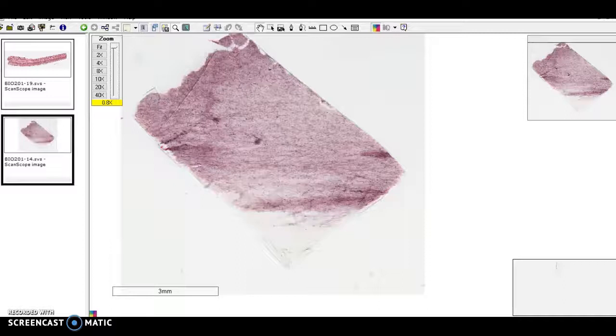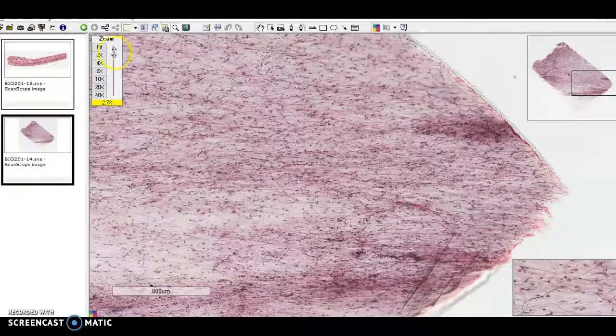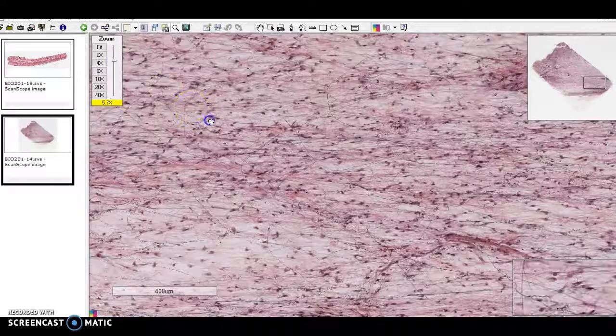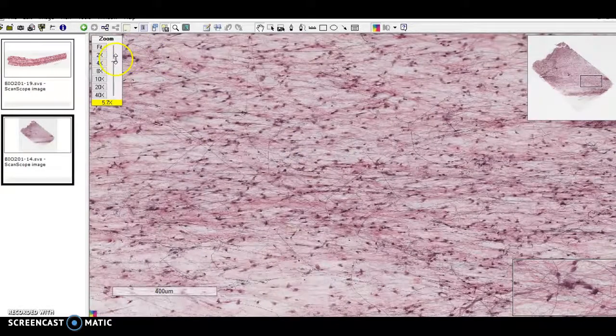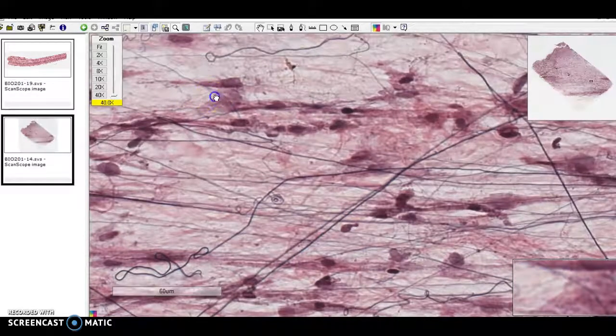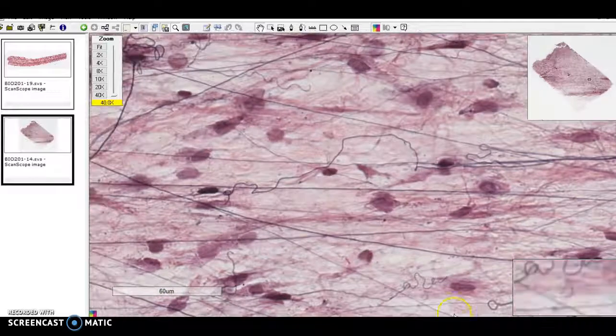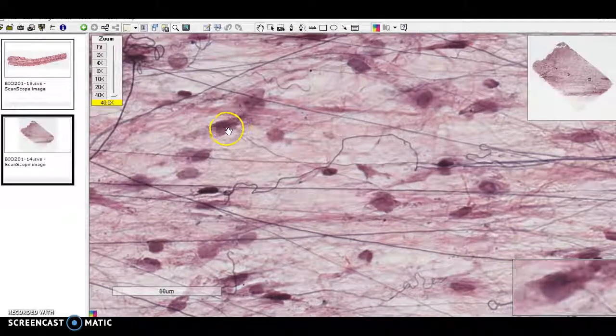And so we see a thin layer of fibers and cells. So I'm going to increase the magnification a little, zoom us in. And as we come in, you can see more individual fibers. You can get a sense of individual cells. And here we go, all the way in. So you'll see quite a few actually cells.